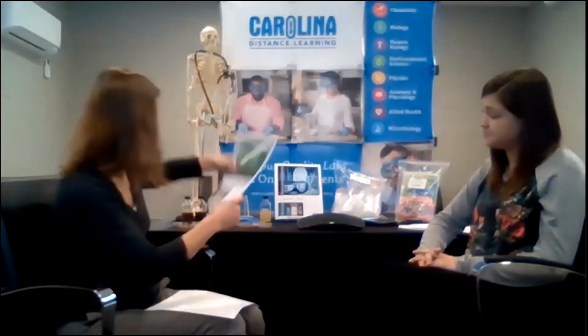Getting specifically into this lab, the microbial inhibition of spices. The general concepts of the lab: this was written for a general biology course, to introduce students to the topic of microbiology. However, you could also use it easily in a microbiology course because it has the same specific skill set.